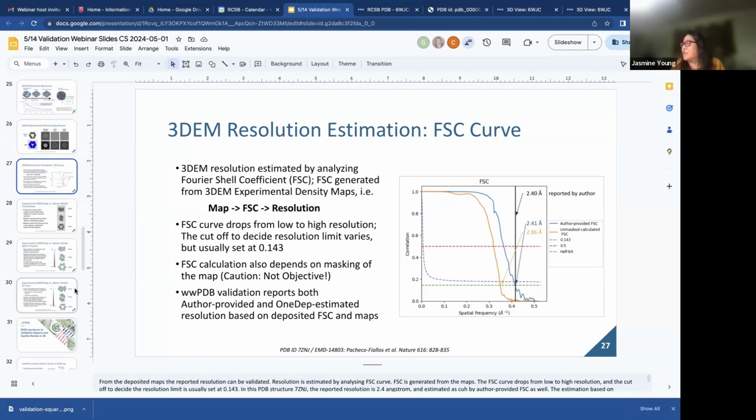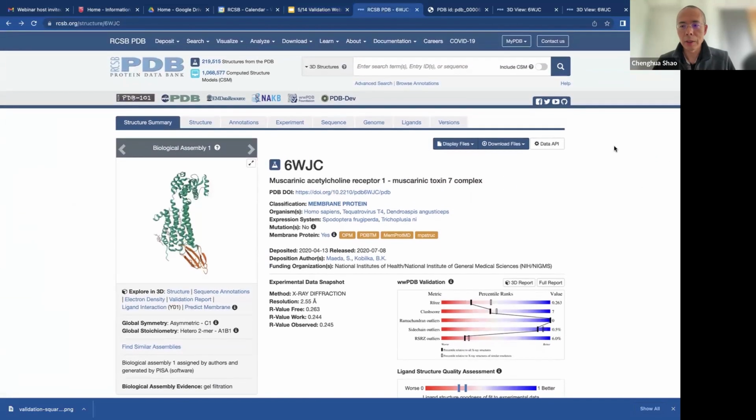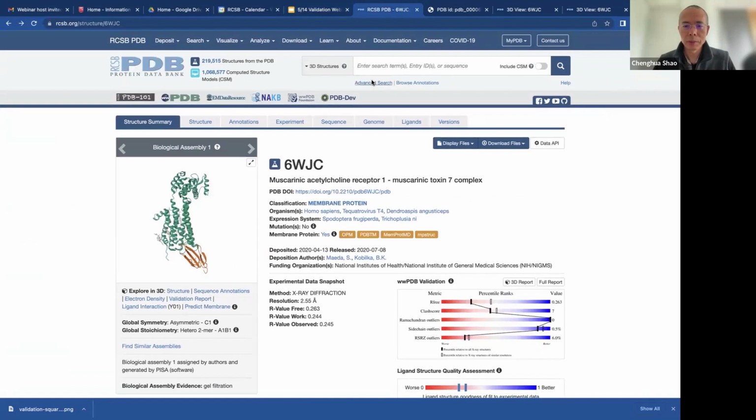Next question. What are the ways to programmatically assess the validation score for a set of structures? I think some of these values are reported in a structure's mmCIF file, but what if I don't want to download the files for a large list of structures? If you want to do it programmatically, you have to have access to the data. For some of this validation information, you can use our API service. Everything has API access. For example, you can use our advanced search.